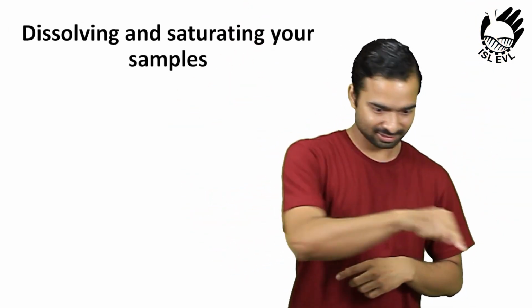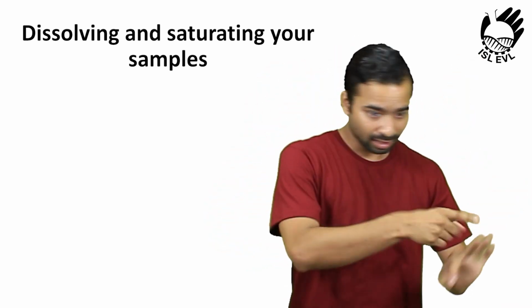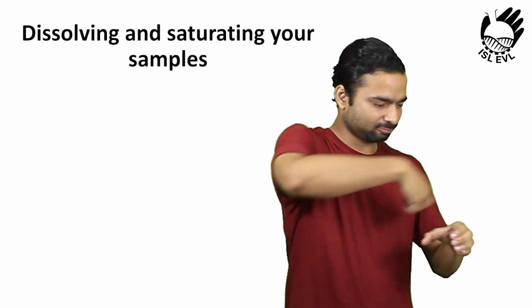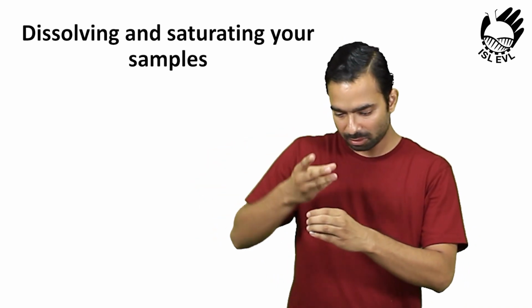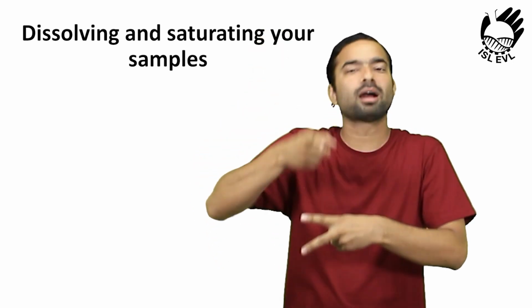Crystallization video part 2. Part A. Dissolving and saturating your samples. In this experiment, we will find out that each sample has its own unique properties.